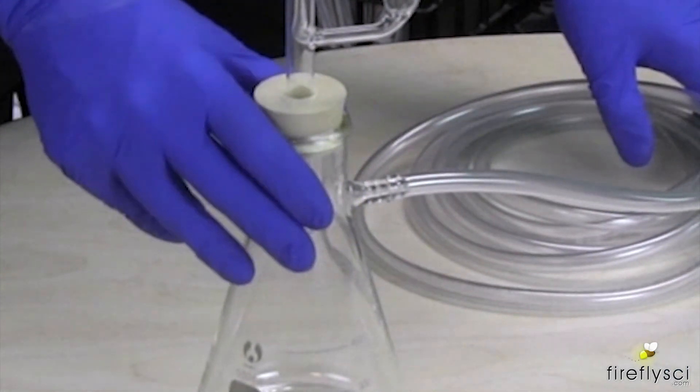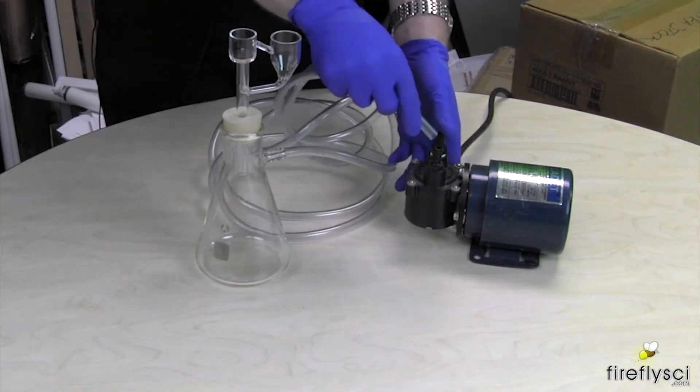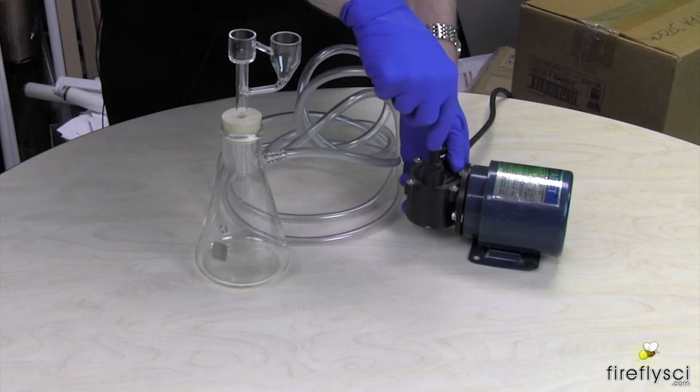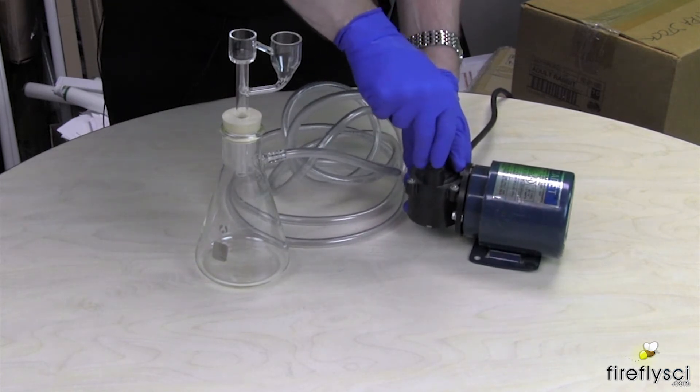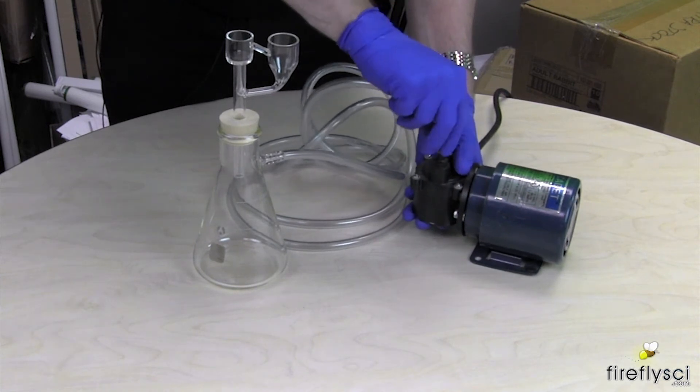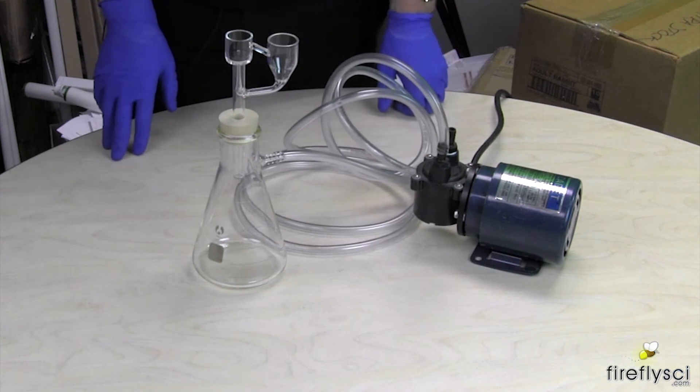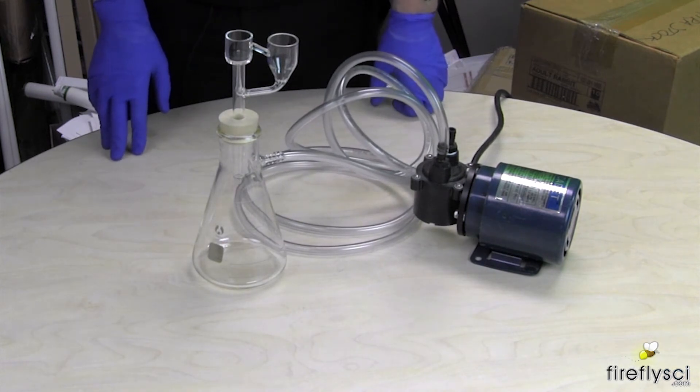And now we're going to hook it up to our vacuum pump. Now we're just going to take our tubing and put it onto the vacuum line here. And then just push it on. It doesn't have to be on all the way, just so it's tight and secure and you're all set. This is all hooked up. Let's get a cuvette and see how it works.